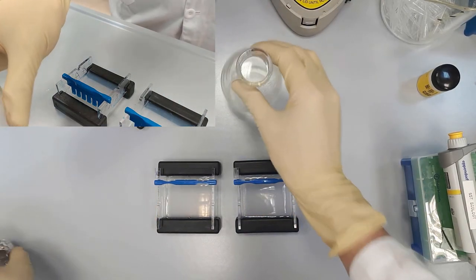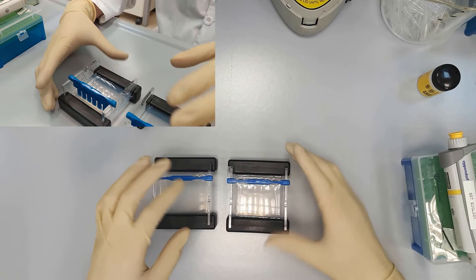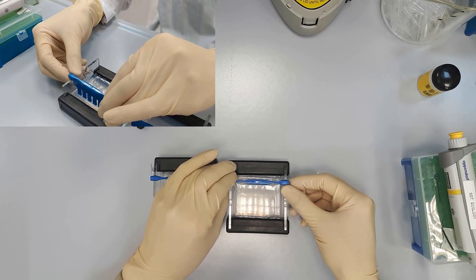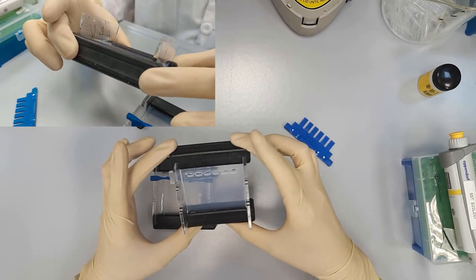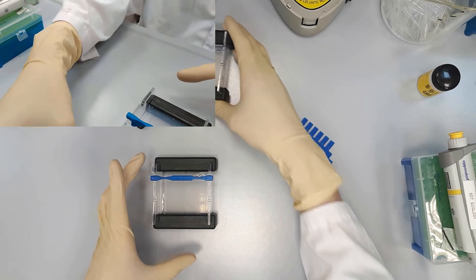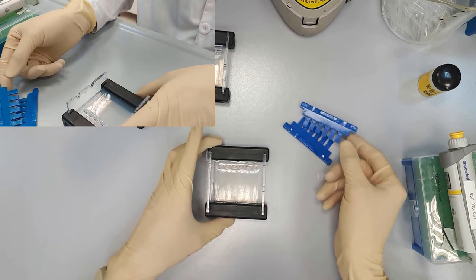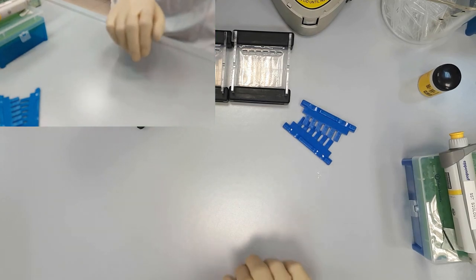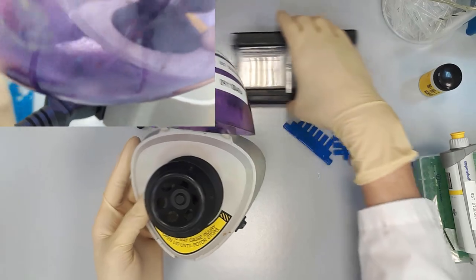Okay, now we have both of our gels ready. And we are going to remove the comb slowly so that we do not damage the wells. So you just slowly pull them. And as you can see here, they are all done now and very solid. Check the wells again. They are all fine. Now we can switch to the preparation of our samples.